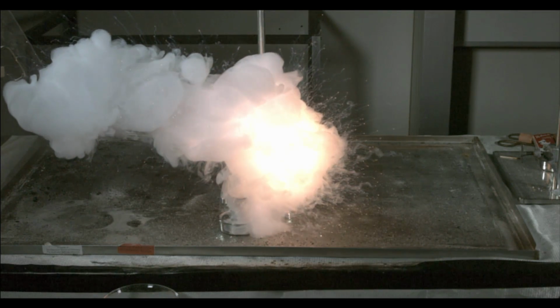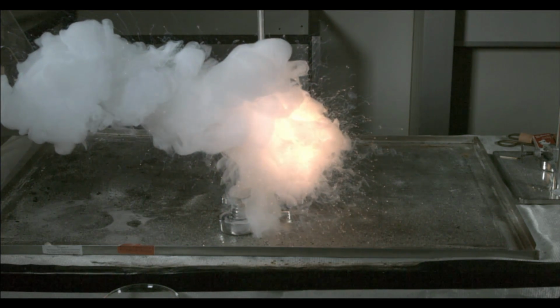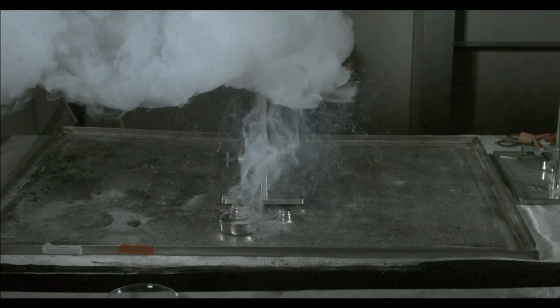So the yellow powder, just the same. We've just replaced the charcoal with potassium carbonate. Oh, maybe it's going to go. Can you hear it crackling? Yeah.